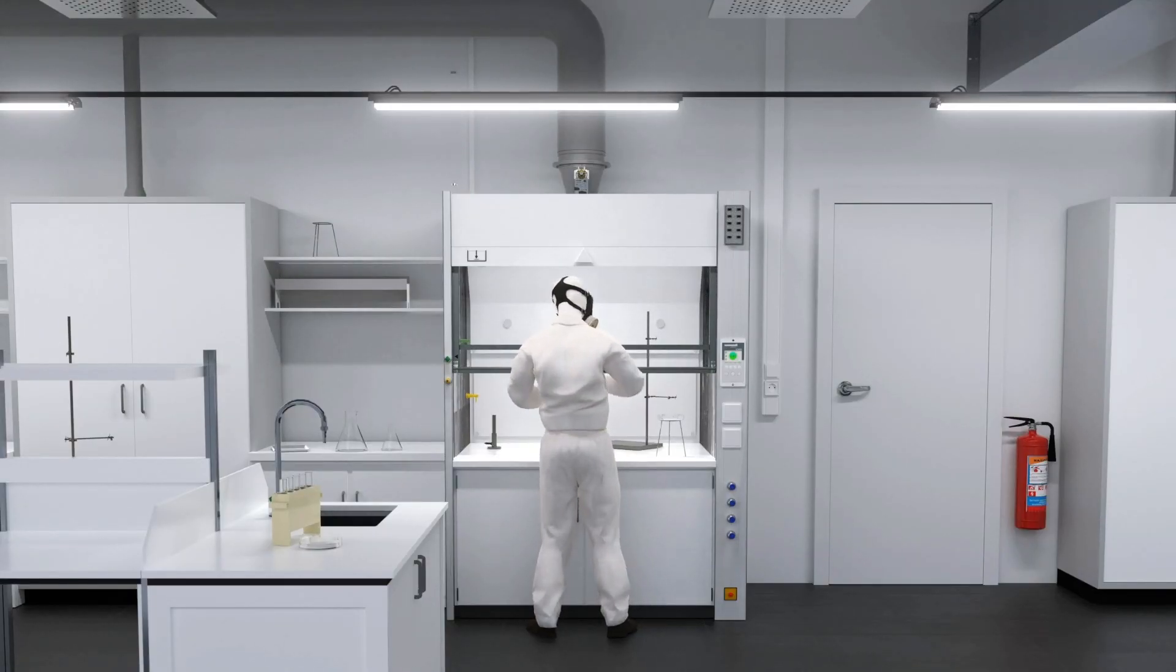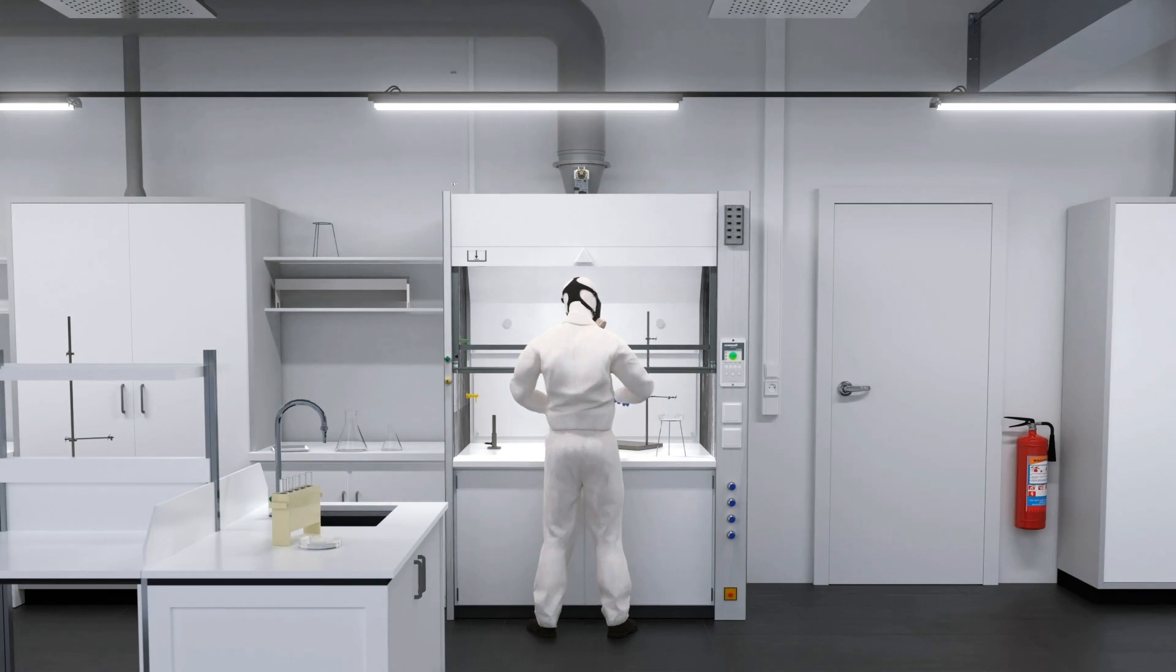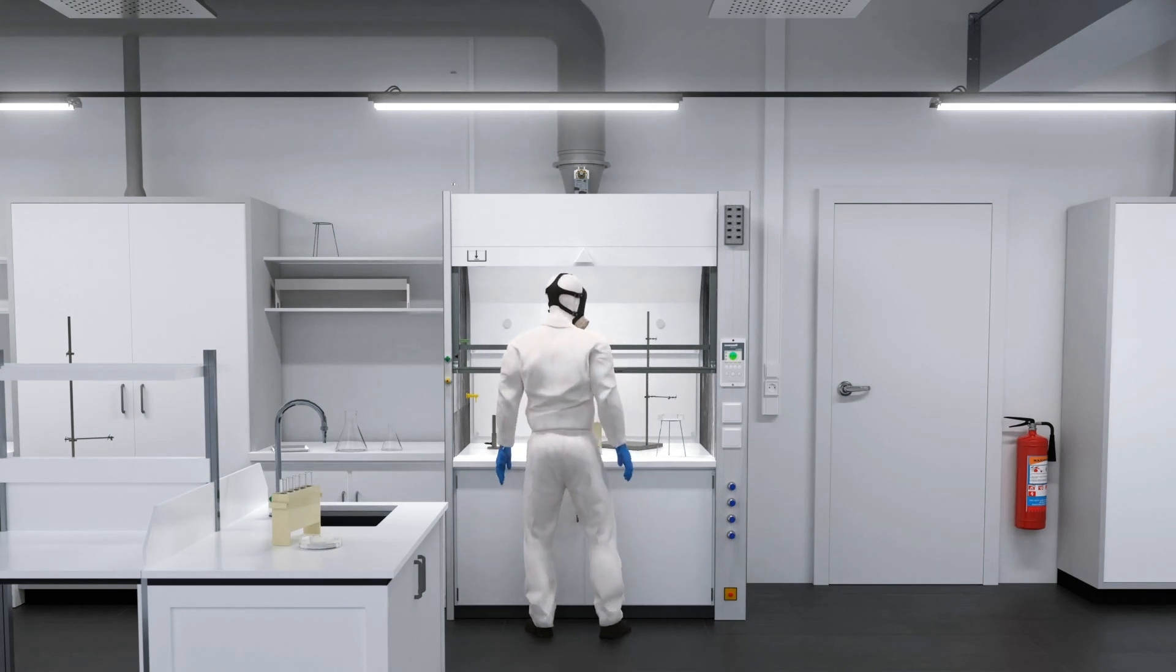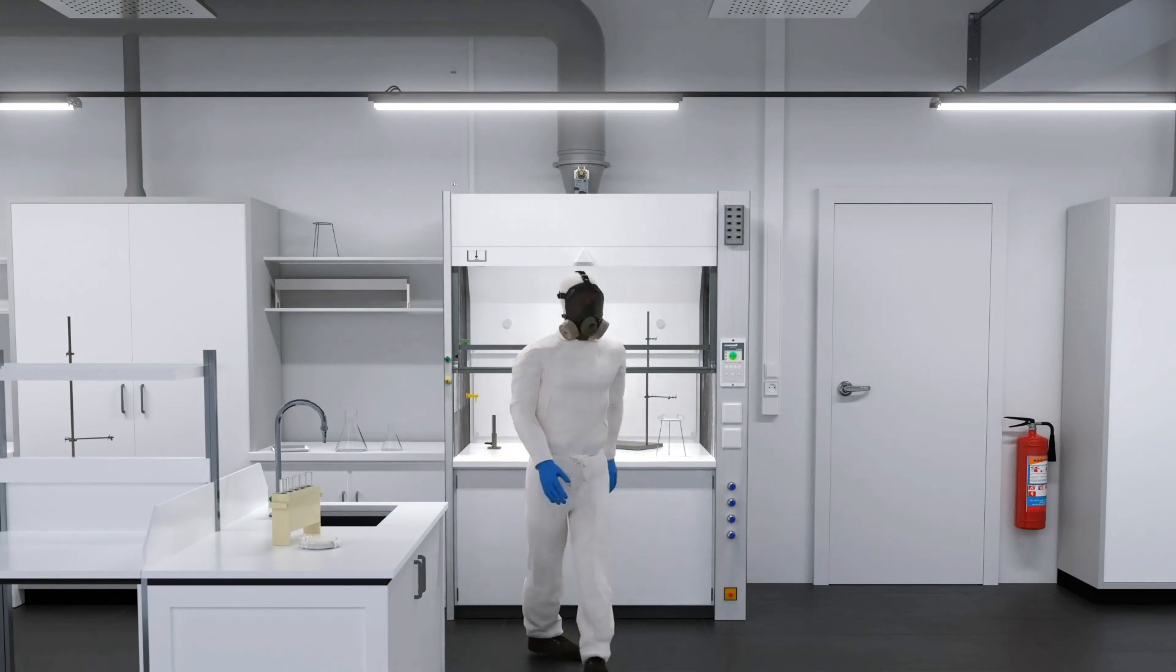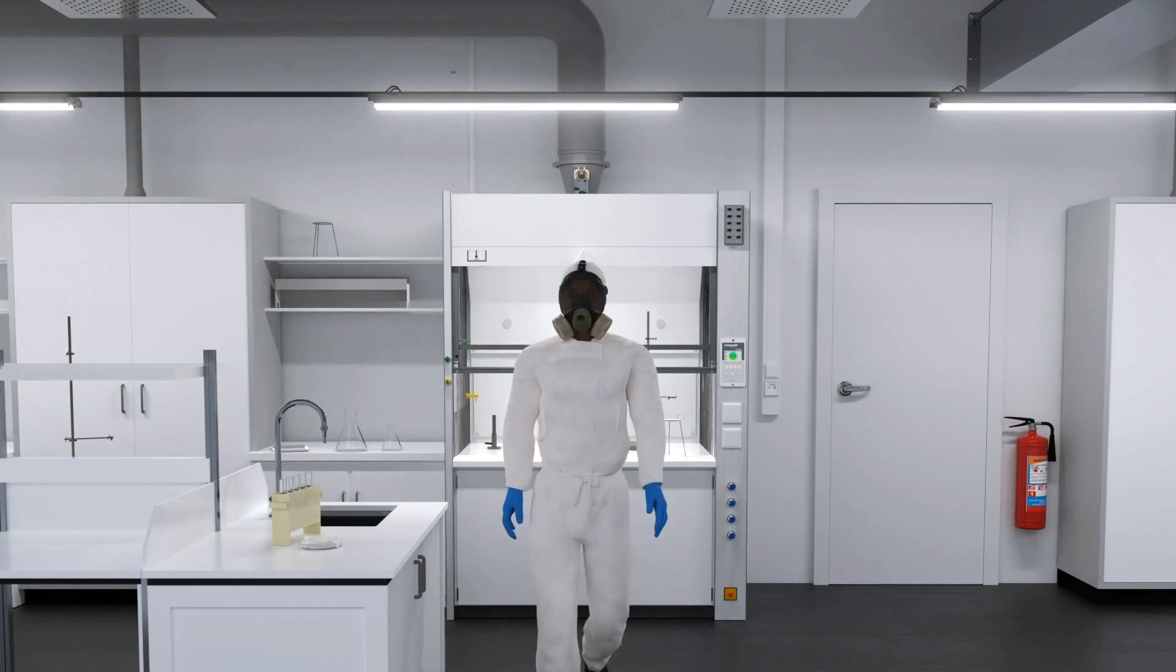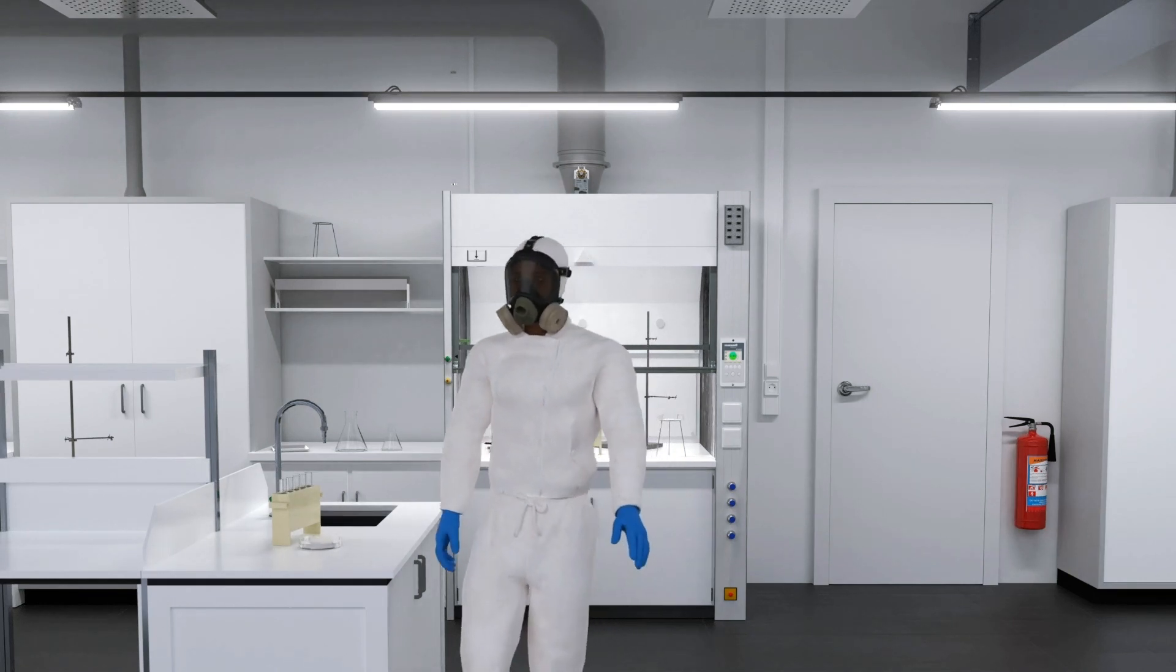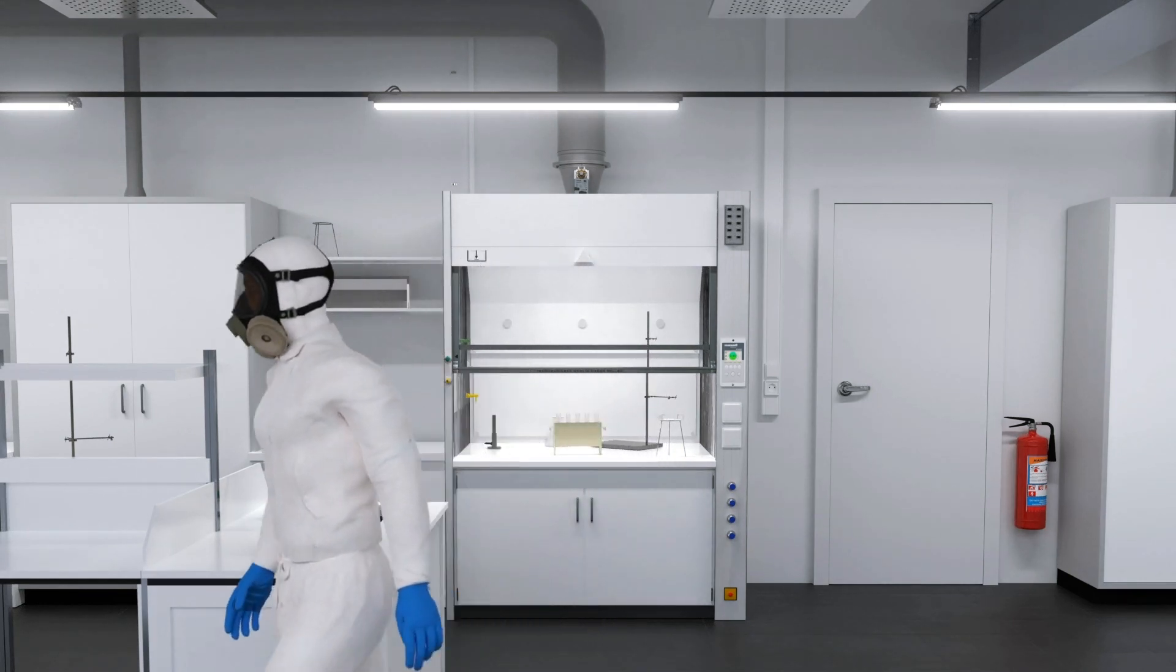For laboratories, the fume hood is an essential equipment to enable a secure and pleasant working environment, and it provides enough space for any type of laboratory instruments.